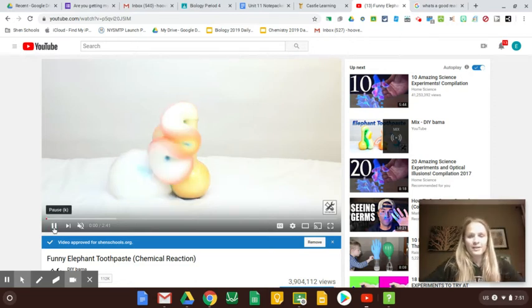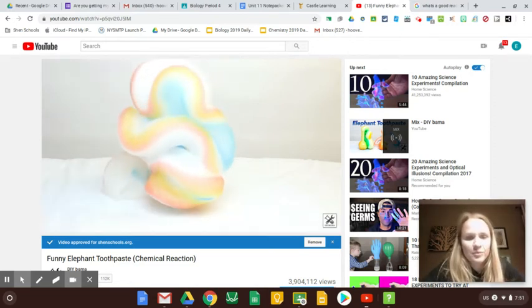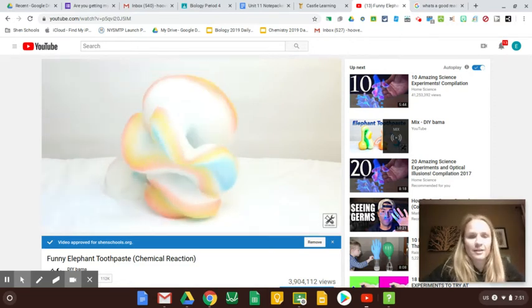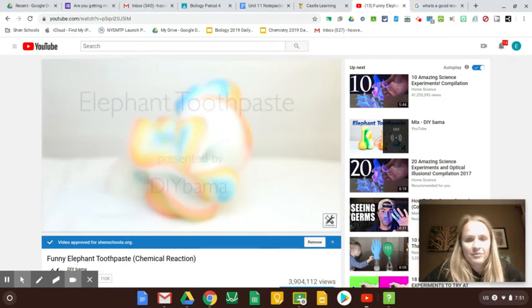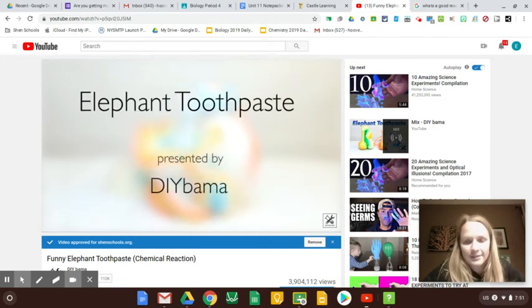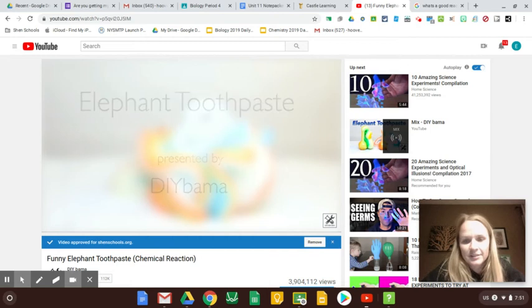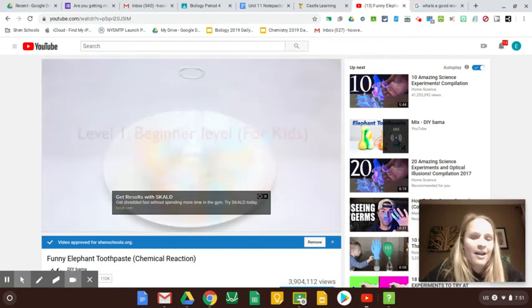So here's elephant's toothpaste. I think it's called elephant's toothpaste because it's big and fluffy and you put color in it. I guess it kind of looks like toothpaste for an elephant because there's a lot of it.